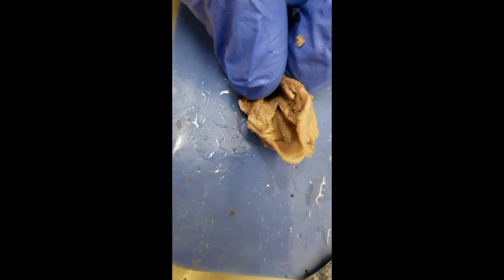This thing's cool looking. The larynx is pretty neat. If you ever do a tracheotomy, that's where you've made a hole in the trachea to help allow air to get through. Because at that point, it was struggling to get air in. Ooh, snap. I just heard something pop. Was it me? Nope. Okay. So this is the inside of this thing. I told you I wasn't going to let you down. So there it is. And so these little flaps here, use the scissors.